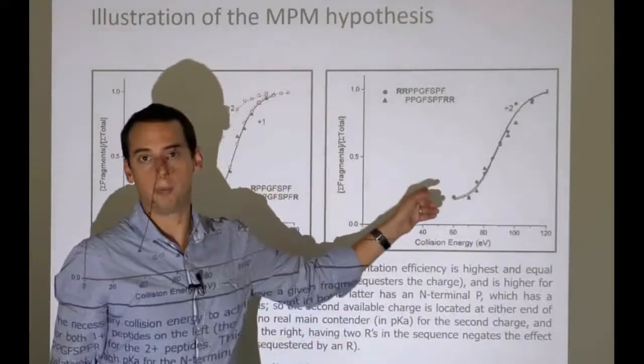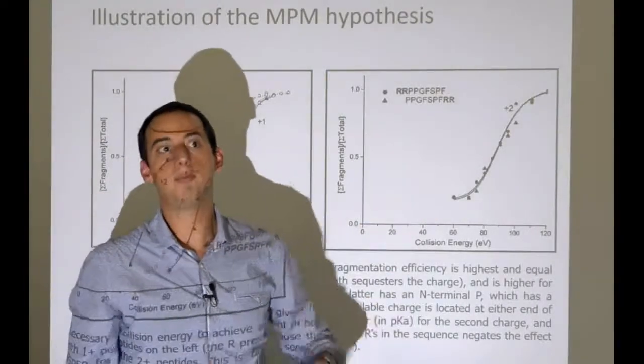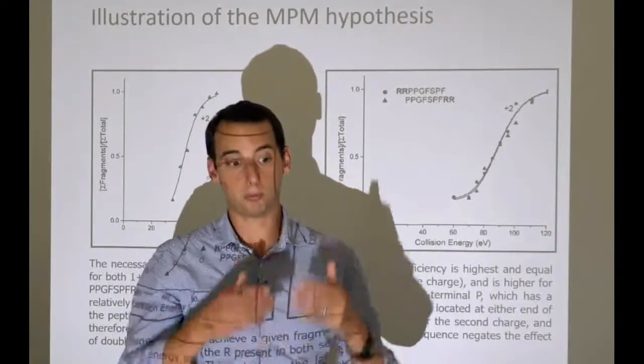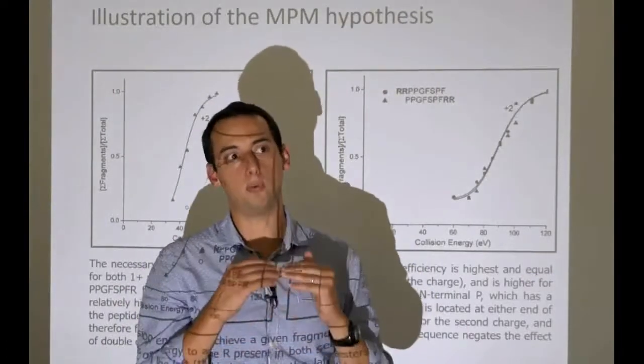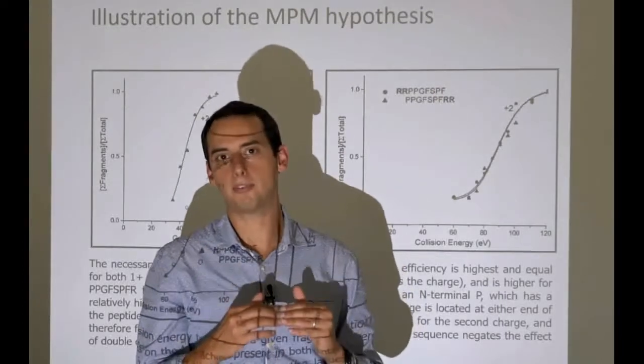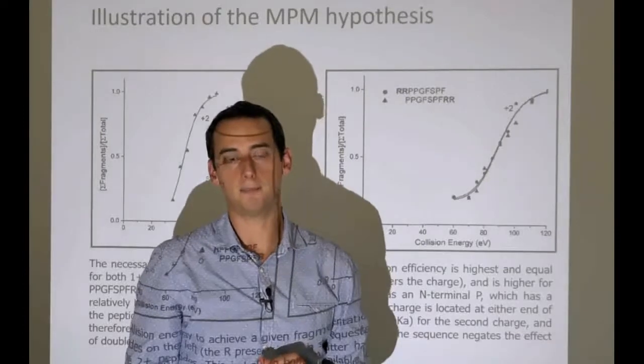That bond is super weak, which means that it's very easy to break the peptide there, which means that in the majority of cases the peptide will break at the proline bond. So if there is an internal proline, expect a really big peak there in the fragment spectrum, because that's the place where the backbone will most likely break.